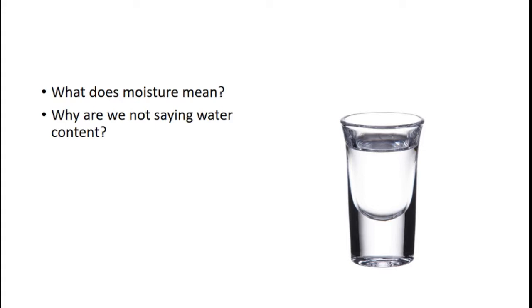So we just sort of summarize this. What does moisture mean? Why are we not saying water content? Well, I've got a little shot glass of imaginary vodka here. Imagine that vodka was, let's say, 60% ethanol. If we were to measure the water content, well, it's 40% water, let's say. If we were to perform the method that I'm going to describe for measuring moisture content, you'd end up with pretty much no residual, and it would all be gone.